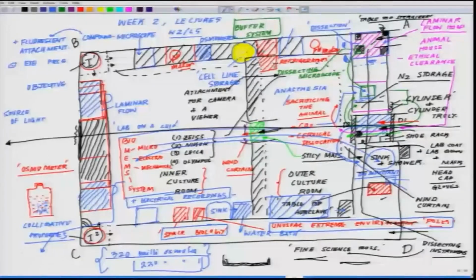We'll be coming later into this about microfluidic setup. There are people who are working on microfluidics, there are people who work on reactor designs or microreactors. Okay, they are working on gas exchange assemblies. There are people who work on lithography.